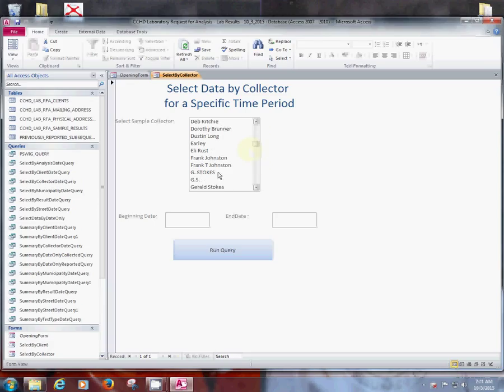And again, this way, GS, probably not a good way to enter data. Early, probably not a good way to enter data, right? SP, certainly not a good way to enter data. TGS, not a good way to enter data. So, be thinking about that.